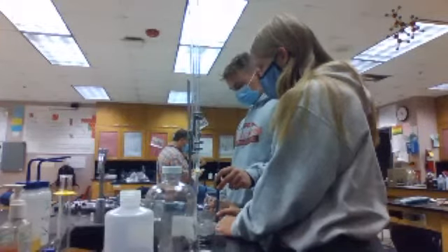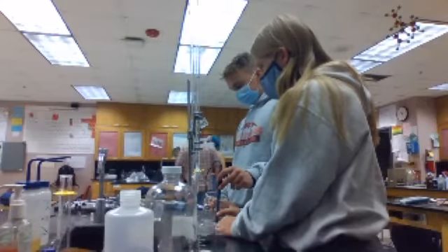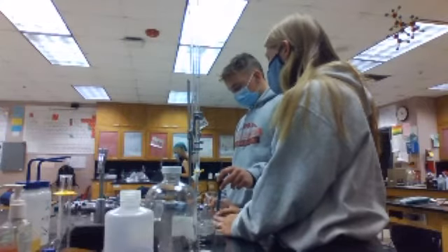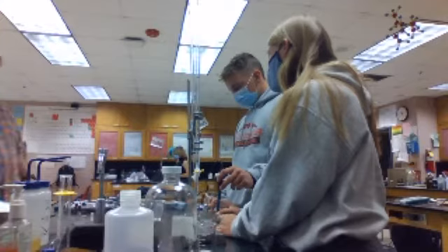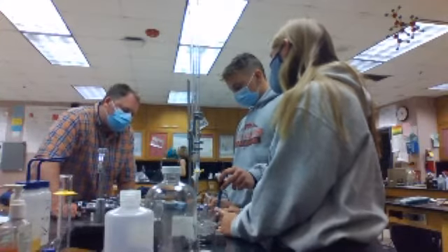So Mr. Jackson, measure every one milliliter of the base until it turns. Let us know; basically what we're trying to make is that graph. Once it turns blue, you'll go beyond though. Mr. Dawson, it won't stop moving. Yeah, we're gonna tell you. 0.97, 0.99. And I don't know where to stop this last time. I think we kind of messed up.